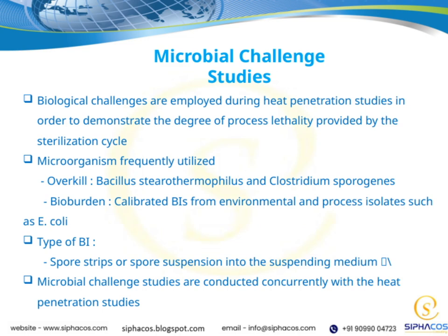It's important to remember that microbial challenge studies are conducted simultaneously with heat penetration studies. This concurrent testing ensures that as we verify the temperature reaches the necessary levels, we also confirm the microorganisms are being effectively killed.